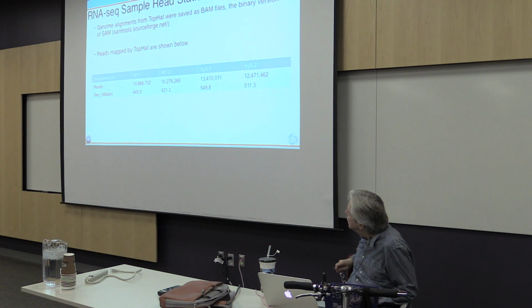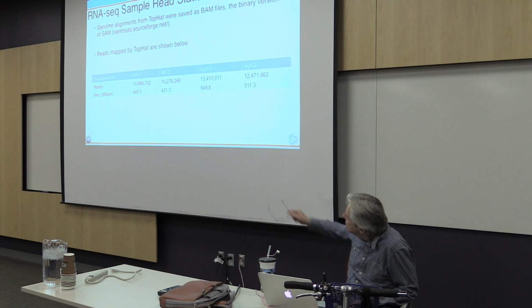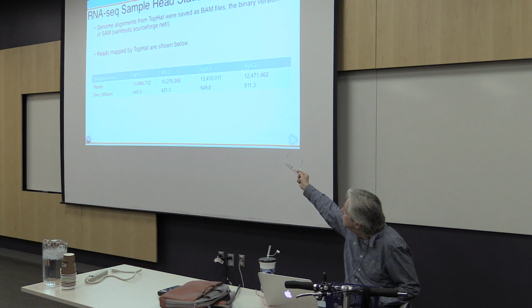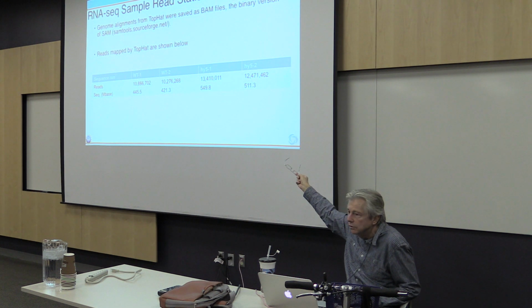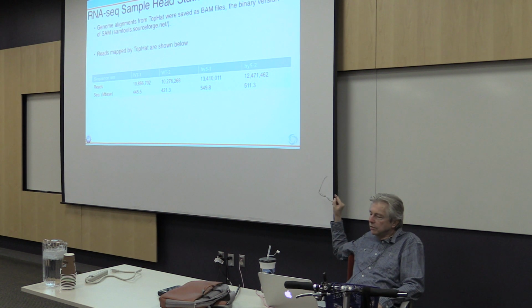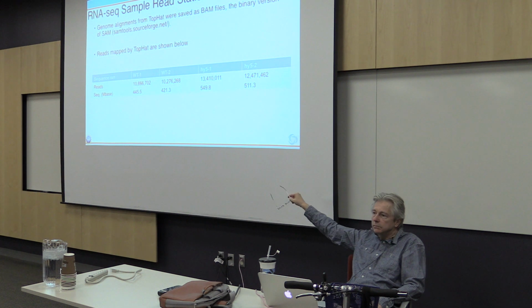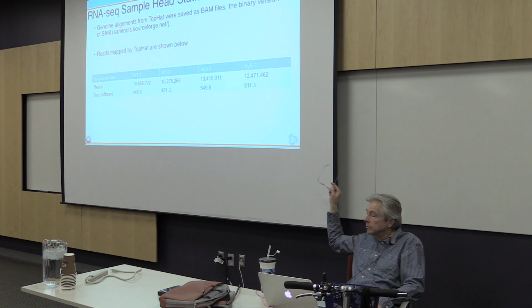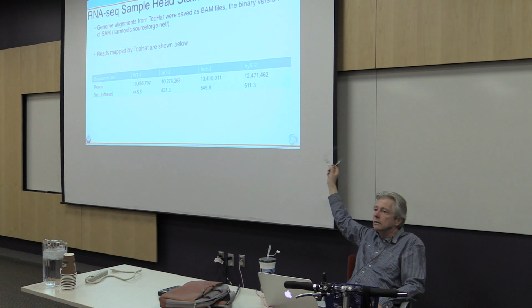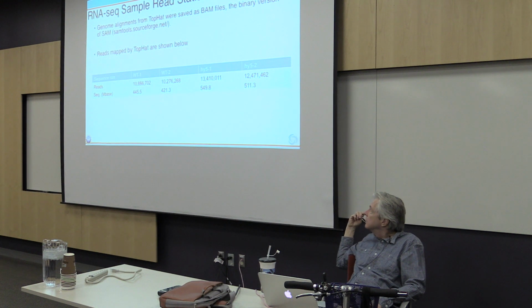Now, the samples that we're going to be working with today are Arabidopsis samples, and they'll be wild type, as you can sort of guess from the brief naming here, WT1, WT2. There's also hy5. hy5 is a type of Arabidopsis. It's not the wild type, the Columbia form. It's a mutant, a certain documented type.